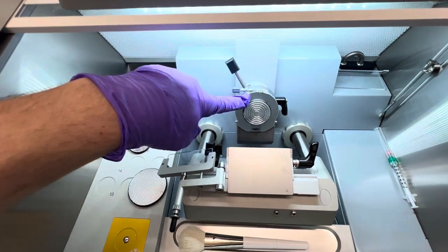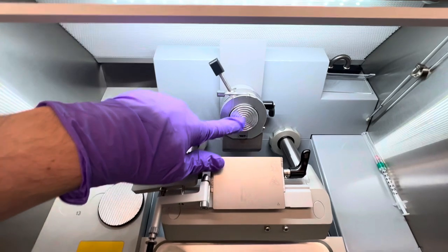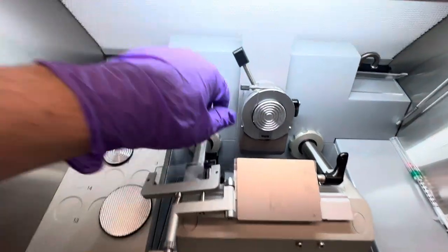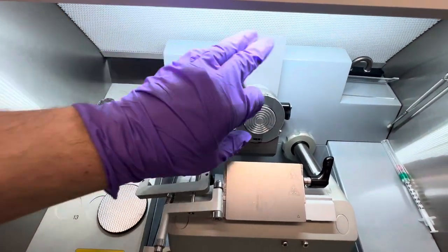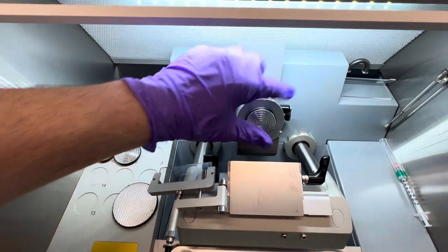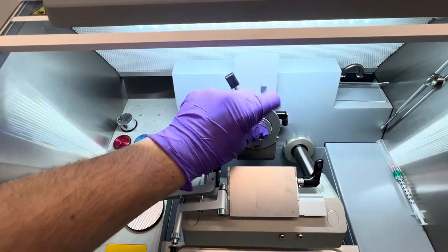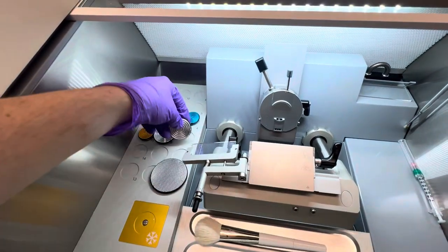This is for actually moving the specimen head. This should always be tight, although you can double check it, because if this gets loosened up, then it would mess up the angle that you're cutting at, and then you take a chunk out of the block that you don't mean to. So that should always be tight, and just don't mess with it otherwise. Unclamp that and put it back because I'm not using it.